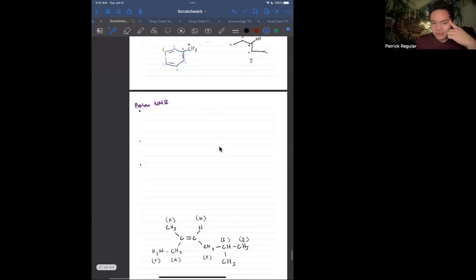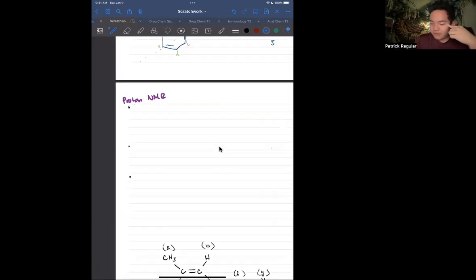Now we get to the nitty gritty stuff, proton NMR. And I will tell you, it's going to be tough to learn. I hated learning this the most, but once I got it, it was easy. It's because again, it's all practice. Once you get the repetition, you recognize the patterns. You know what to do.